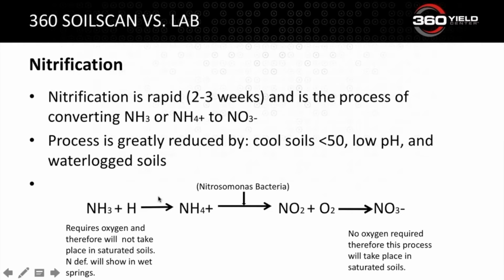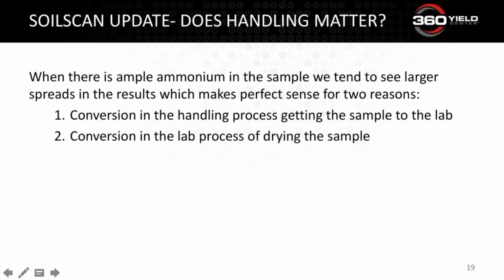If you go to the next slide, Caitlin, we've done some work. There really are two parts I want to discuss as we think about the process. Is there conversion that goes on in the handling process of getting that sample to the lab? And then I also want to talk a little bit about what happens to that sample in the lab. What do they do with that sample, and could that impact it as well?